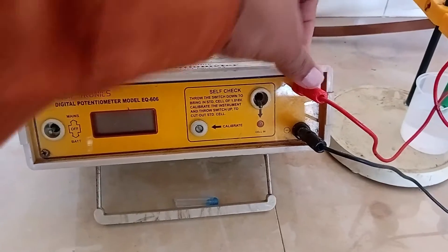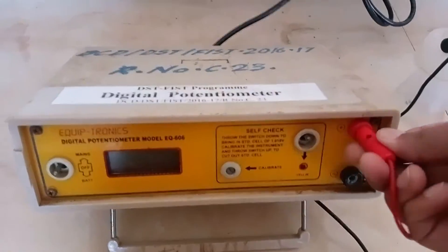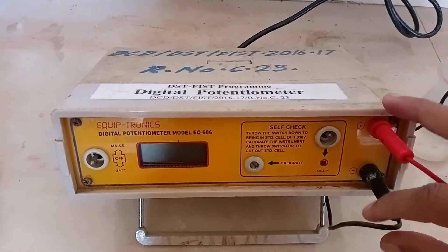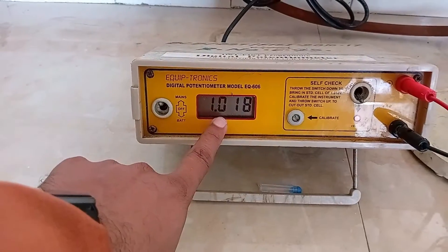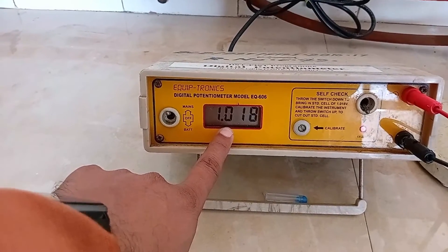These are the two electrode input knobs. These inputs are used to join two electrodes — the reference and indicator electrodes — to the potentiometer. This is the display of the digital potentiometer, which shows the EMF value in volts.